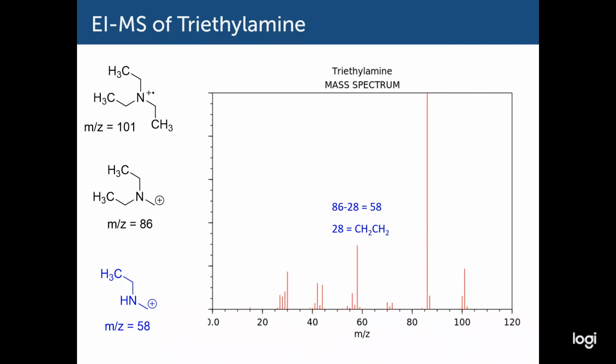So one of the things to take away from this slide is that fragments can also fragment. Typically, it's helpful to work these spectra from right to left.